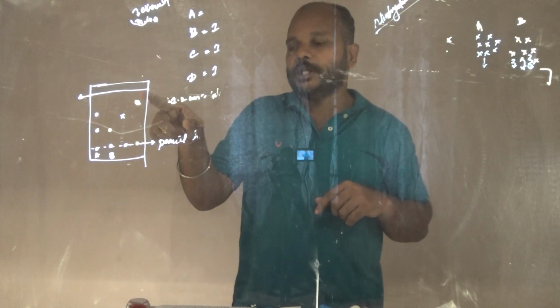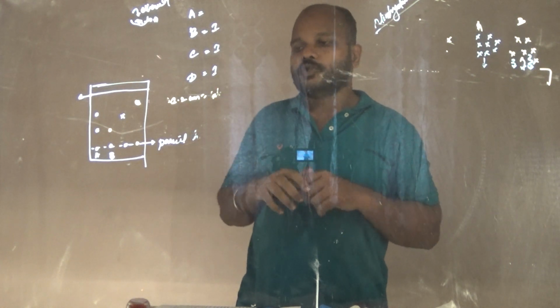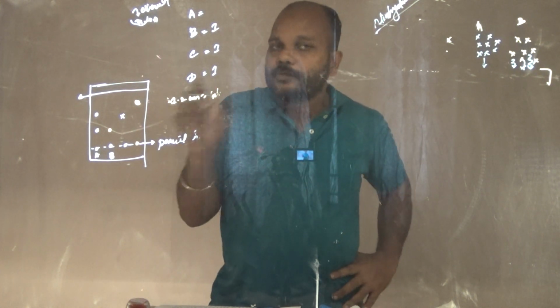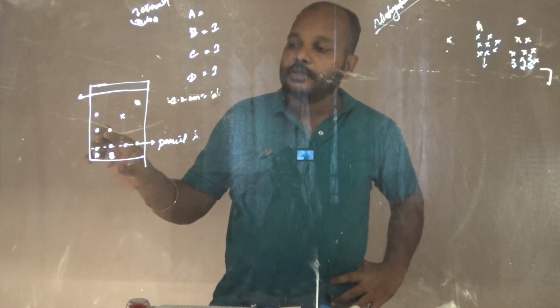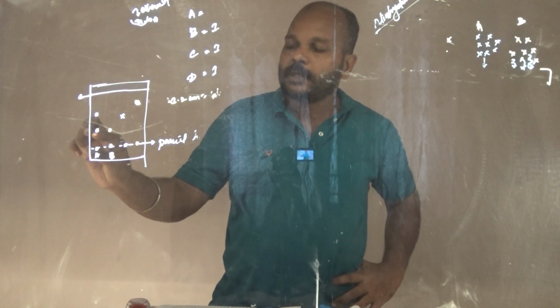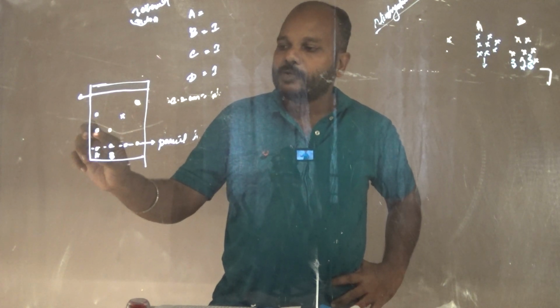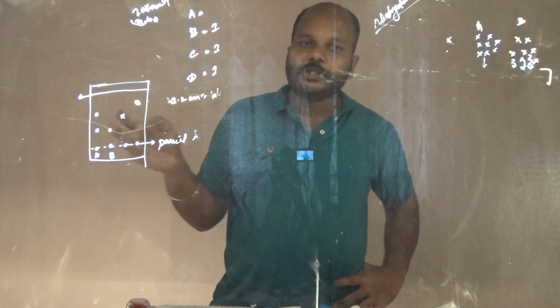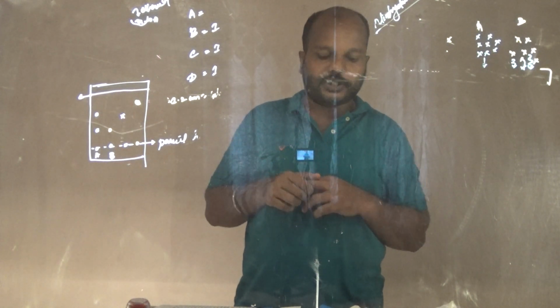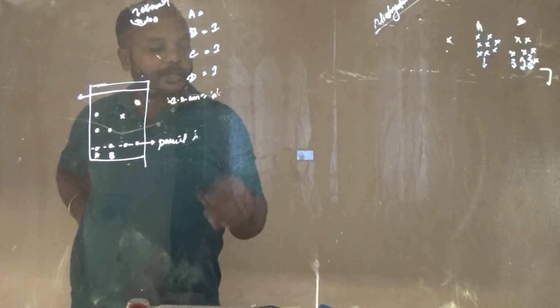Now let me see. Let it be 1.2 is the distance traveled by the solvent, so we will just note it. This spot, let it be component A, contains two components, A1 and A2. A1 might have traveled some 0.2 centimeter, and A2 might have traveled 0.8 centimeter. That also we will note, the distance traveled by these amino acid moieties.